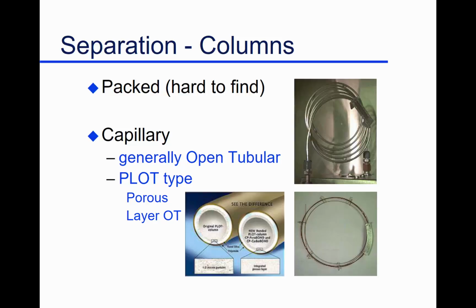So those are the 3 most common ways of getting a sample into a gas chromatograph. Split injection, got a lot of material, no problem detecting it. We get nice, clean, quick injections that give us really good chromatography. The splitless injection, we're looking for trace amounts of material. We're really searching. And we dump as much onto the column before we sweep it out and get the chromatography going. On column, we're looking to keep heat-sensitive materials intact.